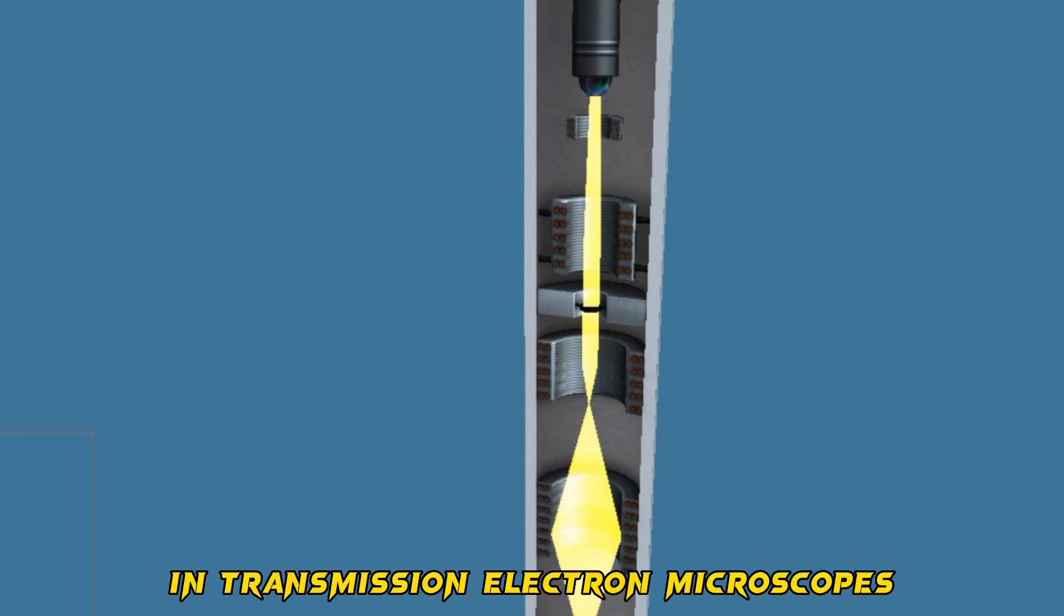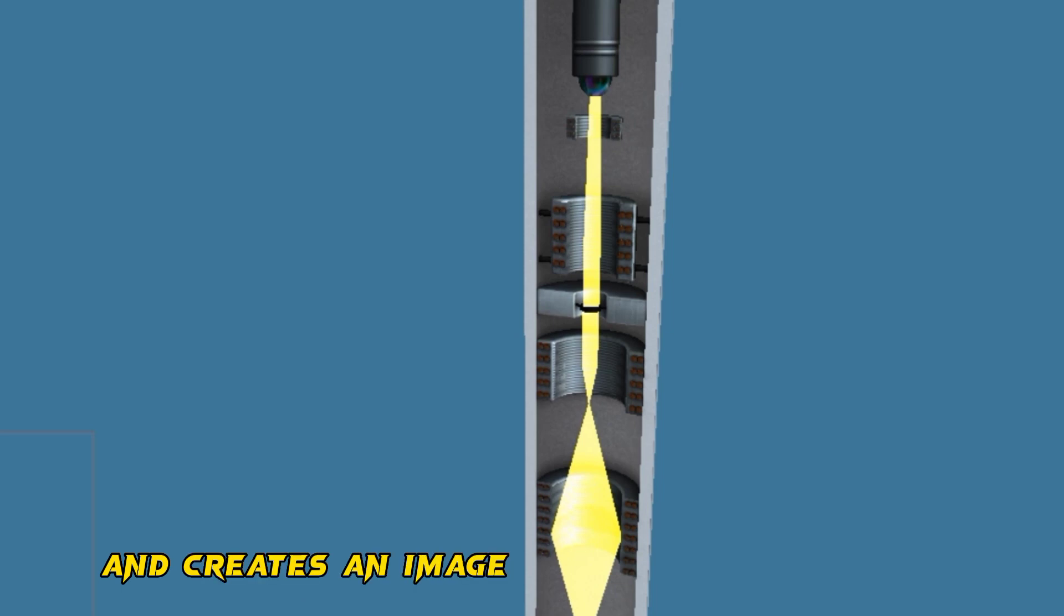In transmission electron microscopes, the beam passes through the thin sample and creates an image using electromagnetic lenses.